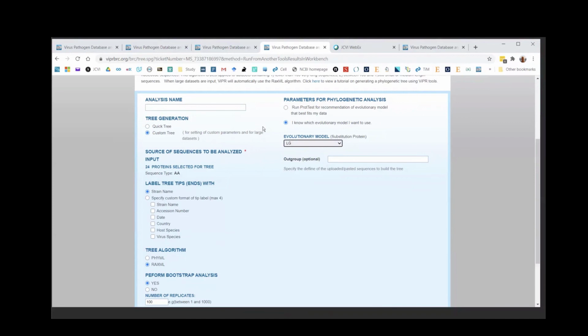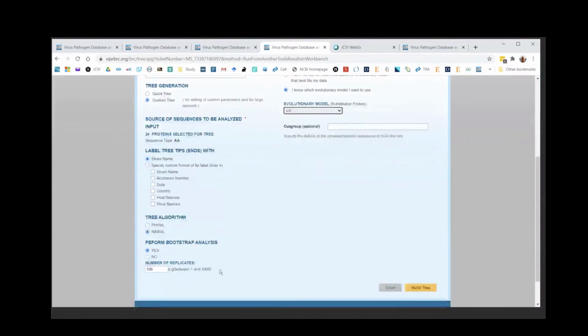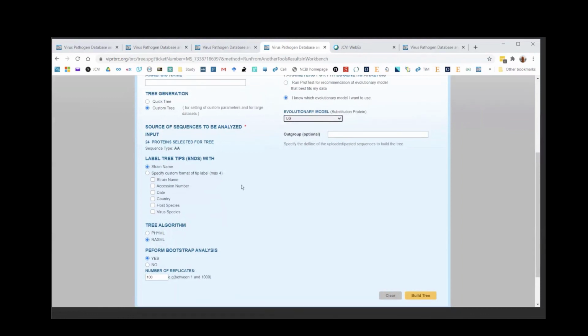So for example, the alignment could be bad, or maybe I used the wrong model, or there are sequences in there which don't belong in there because they're too distant. But I think it's not worth worrying too much at the beginning because as long as you calculate support values, it will tell you whether what you did is reliable or not. So as I said, at this point, I would just calculate an initial tree and see how well supported it is.